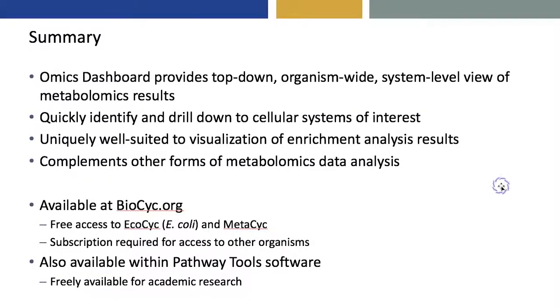So in summary, the Omics Dashboard provides a top-down, organism-wide, system-level view of omics data that lets the user quickly identify which cellular systems are changing in different ways, lets you drill down to examine the component subsystems in more detail. It's very well suited to visualization of enrichment analyses, and it complements other forms of omics data analysis.